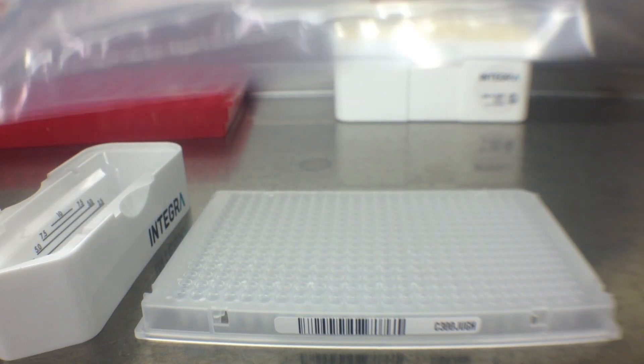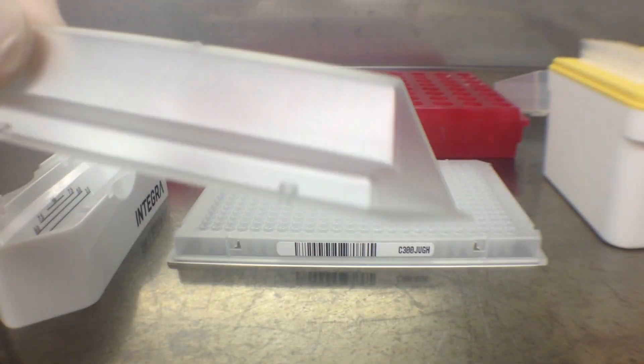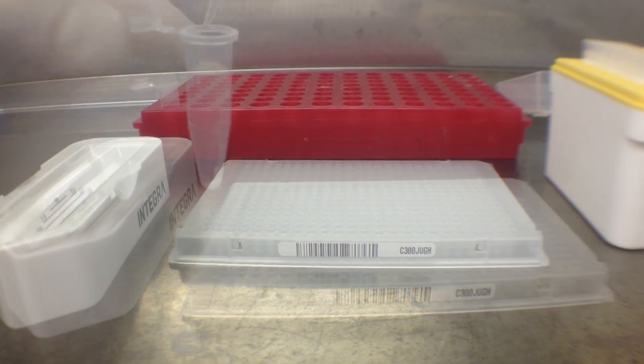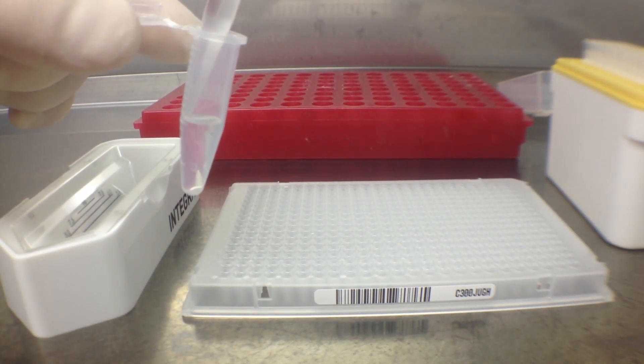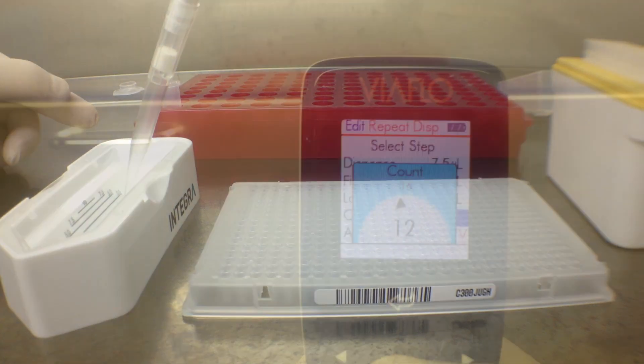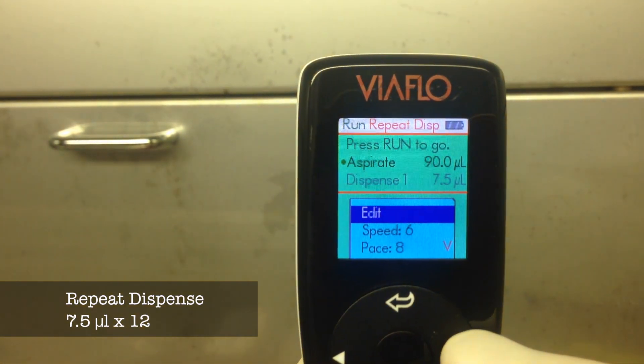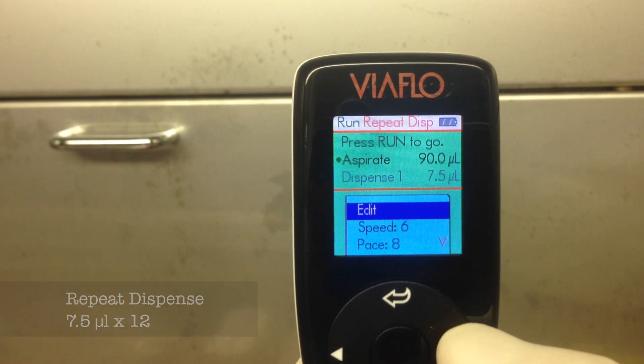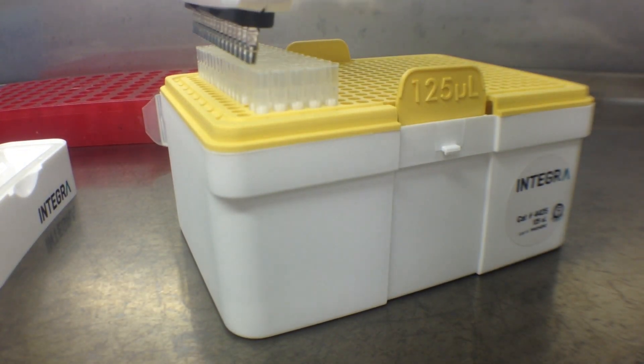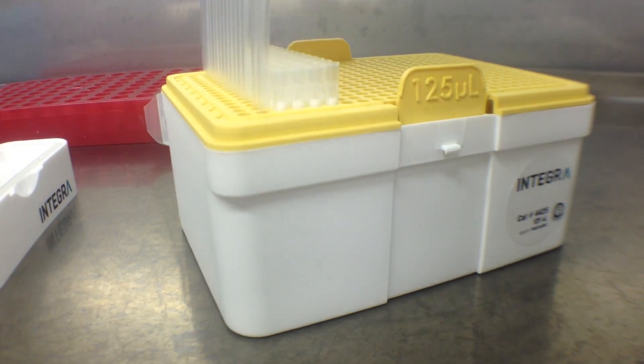So the first step is to make up the master mix and transfer it to a reservoir. We use these low volume single-use disposable reservoirs. Here I'm adding the master mix for my Gene of Interest 1. The 16 channel VioFlow pipette is then set to repeat dispense 7.5 microliters 12 times. These are the specially designed grip tips.